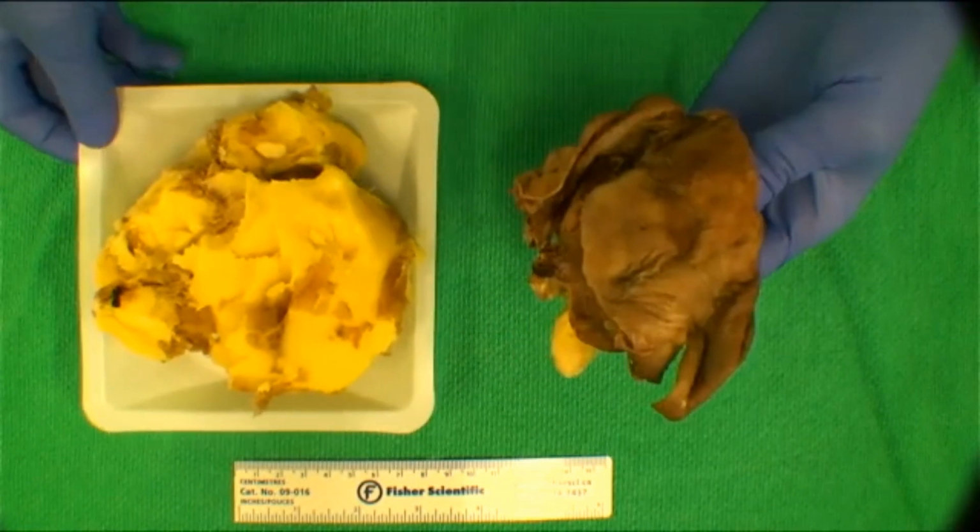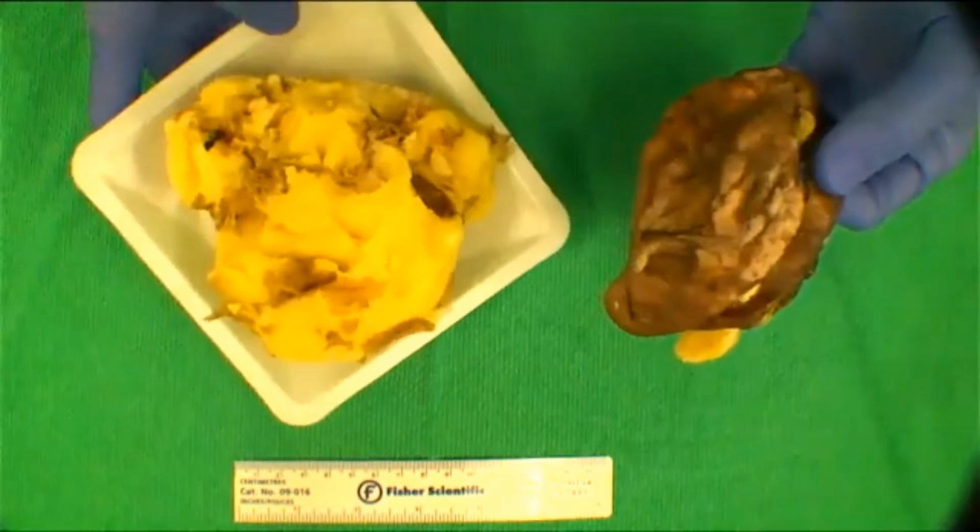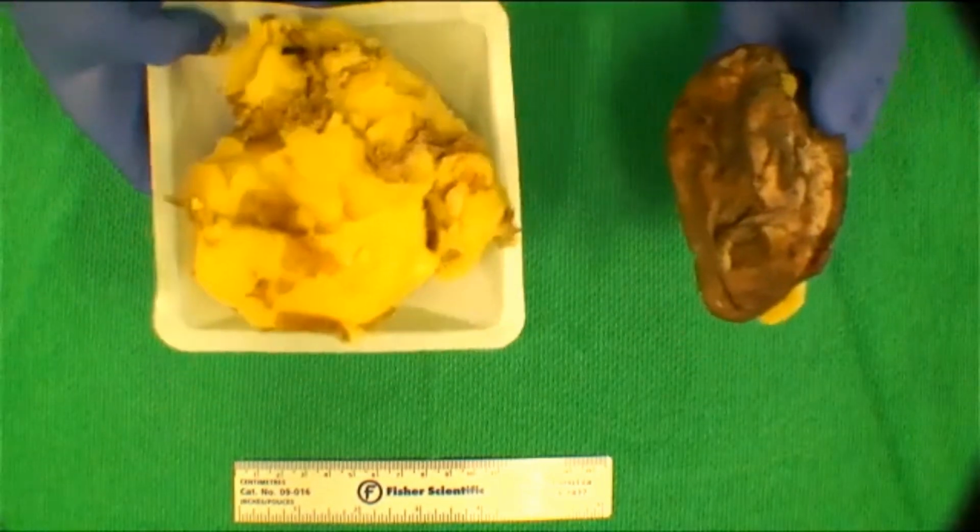So with that, I will show you what the specimen is. Any ideas what this is? People have had breakfast. Awesome. This is indeed a teratoma, and I'm going to put away this really lovely looking piece.